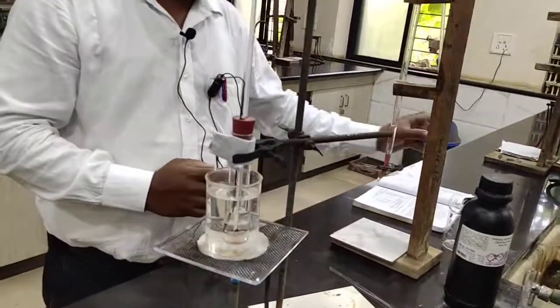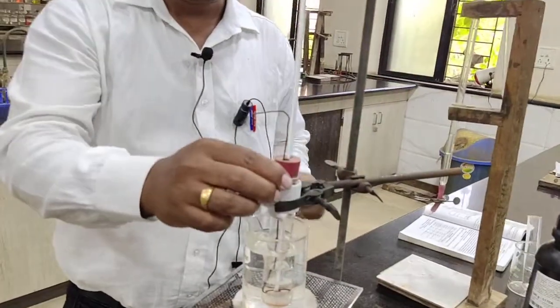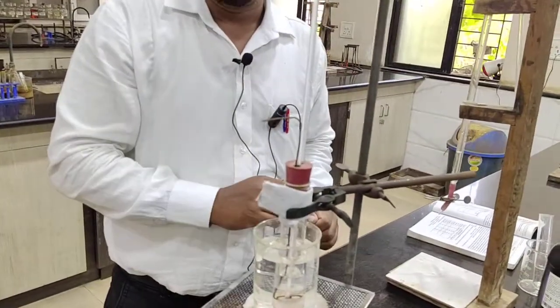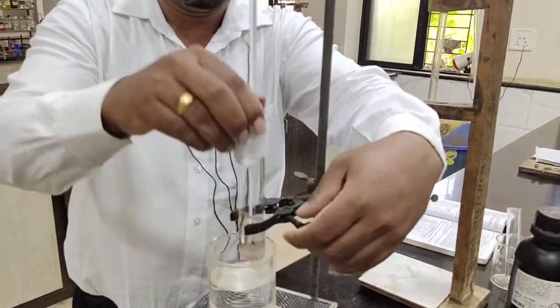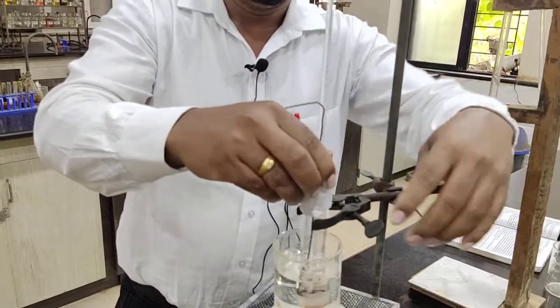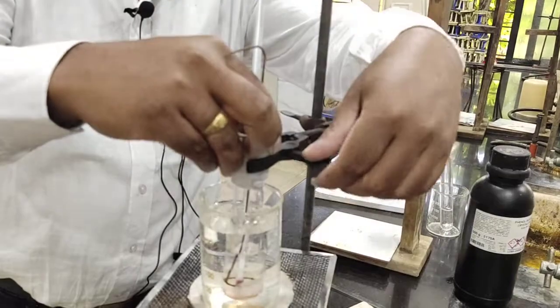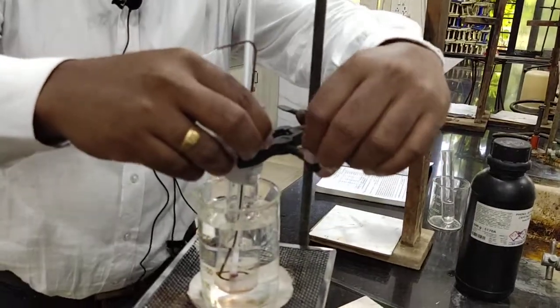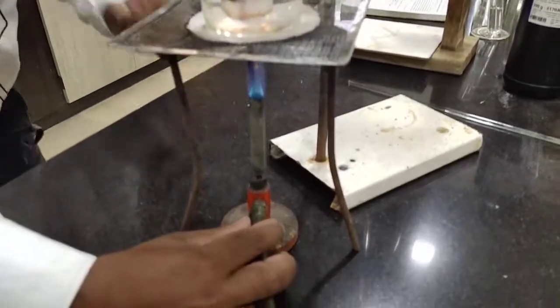Take that in the hard glass tube and add 6 ml of water to it. Okay, so you will prepare a system like this, then dip it in the water bath, make the setup like this, and heat this system with a burner.